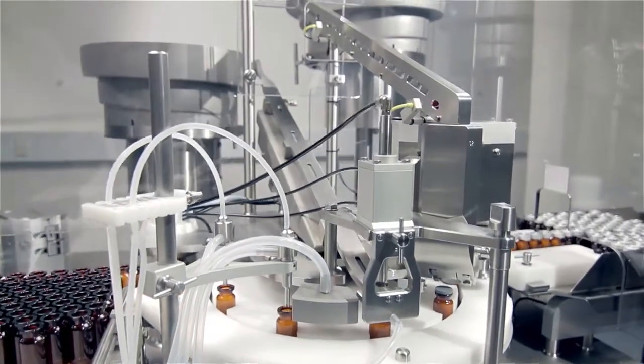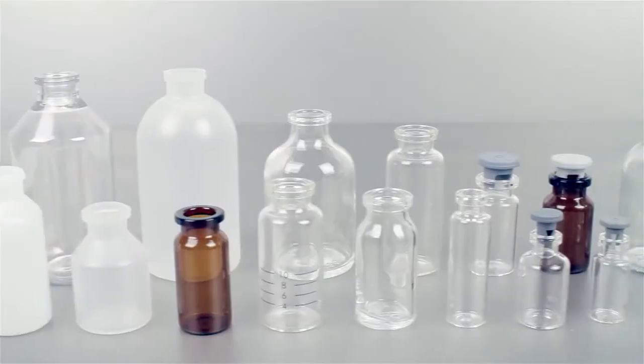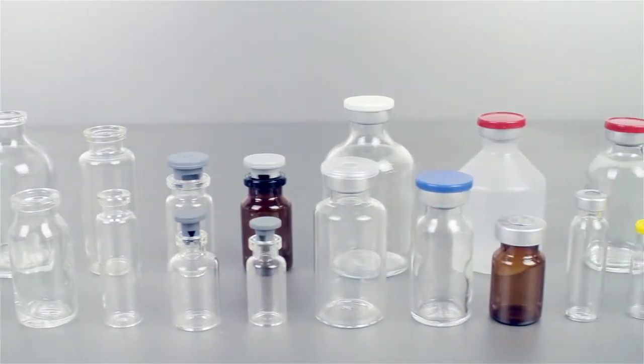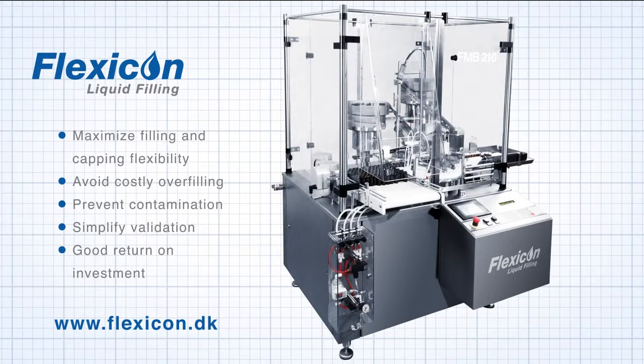Our automatic filling and capping systems have been installed in more than 37 countries serving the diagnostic, biotech and pharmaceutical industries. The systems are extremely reliable, deliver improved flexibility, reduced production costs, minimum risk of leaking containers, less costly overfilling and a more efficient validation process.